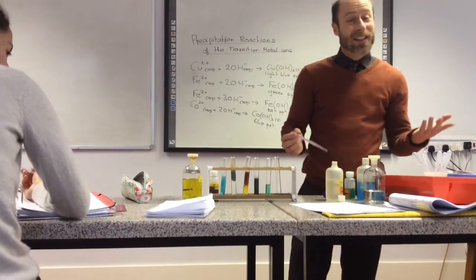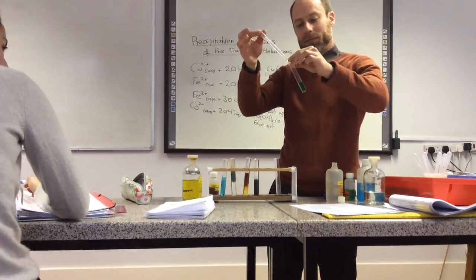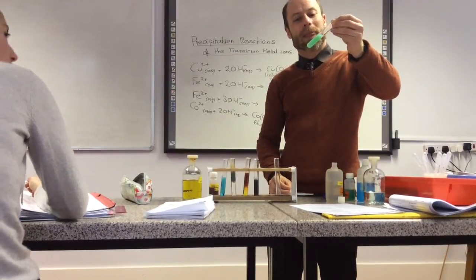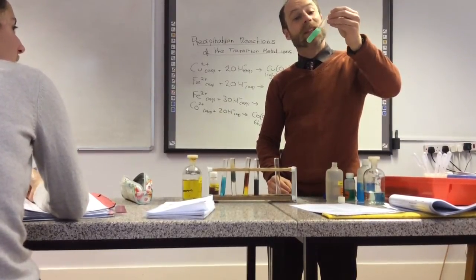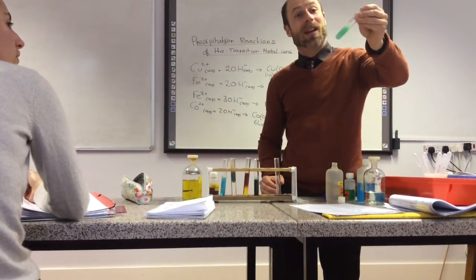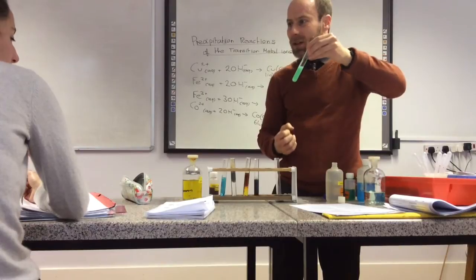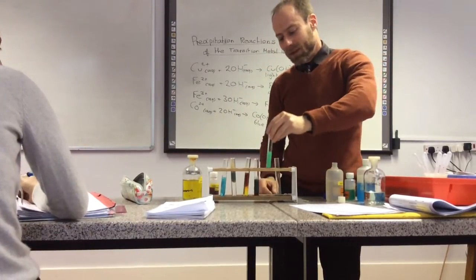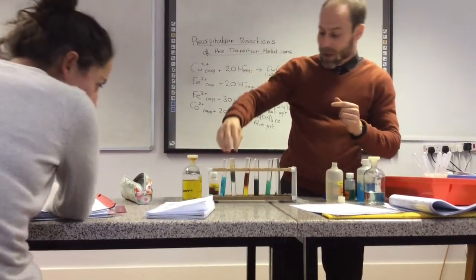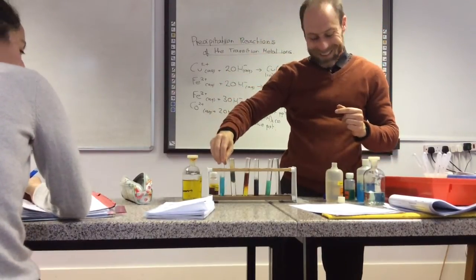Nickel 2+ — you don't need to know this, but let's do it for fun. This isn't actually as exciting as you think it would be. It's like a mint green colour — peppermint green. It's the jelly-like gelatinous precipitate. It doesn't give you a nice solid. Most precipitates are gelatinous though — sometimes the solid settles down to the bottom. If you look at this one, it's still cloudy.